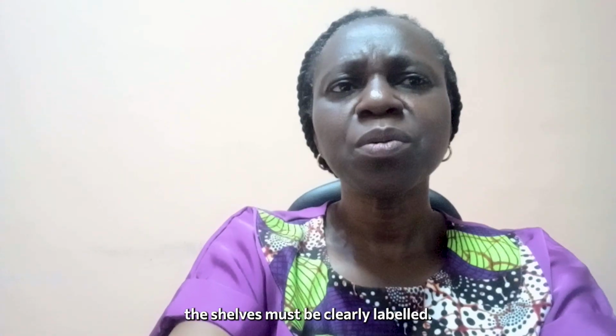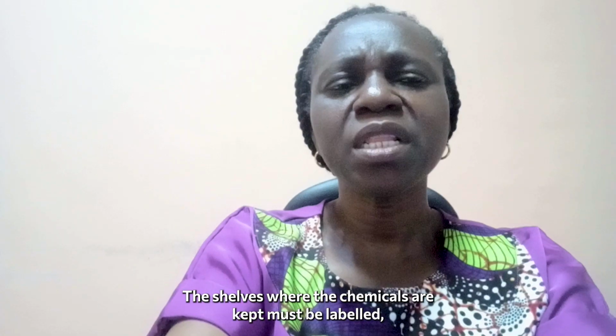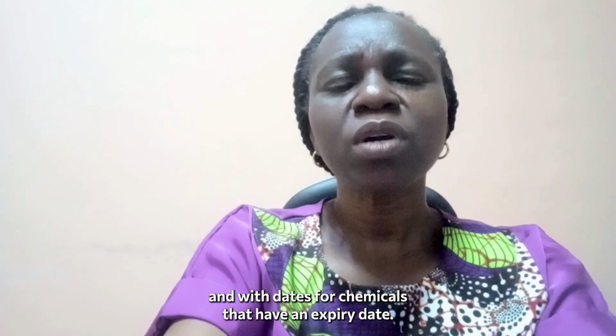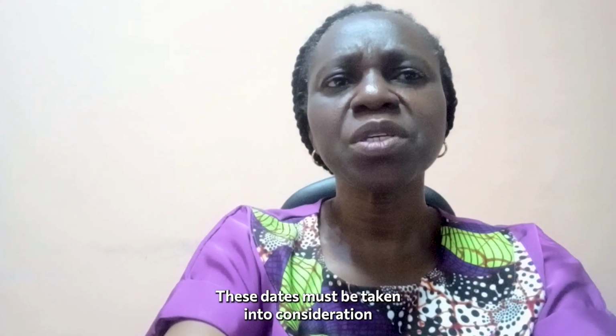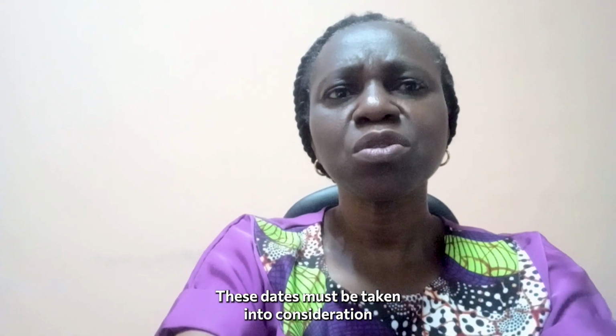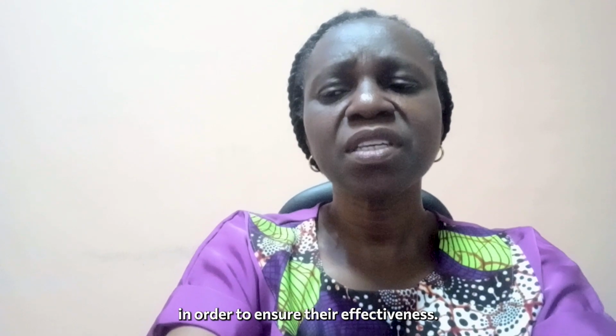Also, the shelves must be clearly labeled. The shelves where the chemicals are kept must be labeled, with dates for chemicals that have expiry dates. These dates must be taken into consideration in order to ensure their effectiveness.